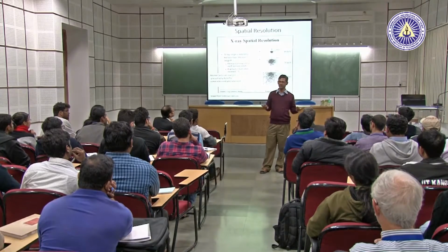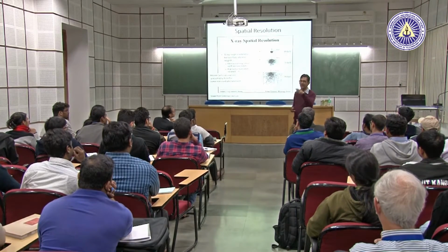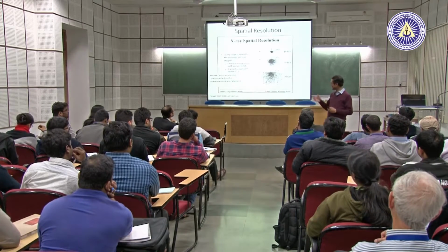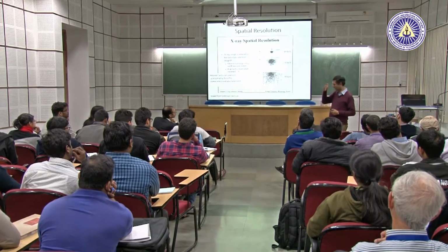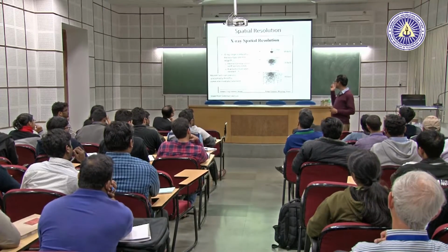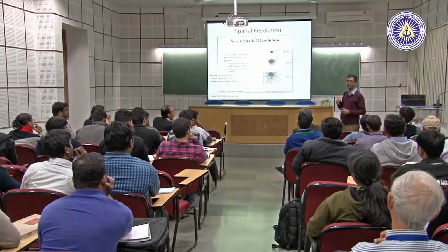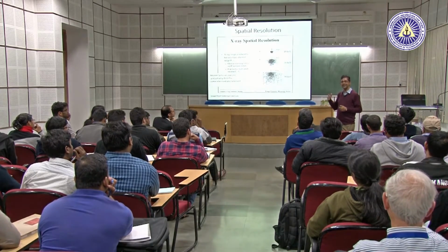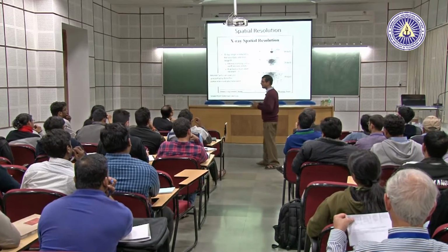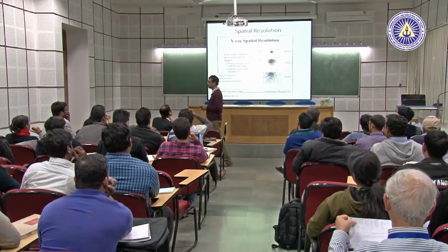The third one is fluorescence. The first 2 factors are predominantly present in all samples. I remember in older microscopes there was a program running in the computer which would correct these corrections. But even if you do this for carbon and oxygen, you will not get good quantified data.